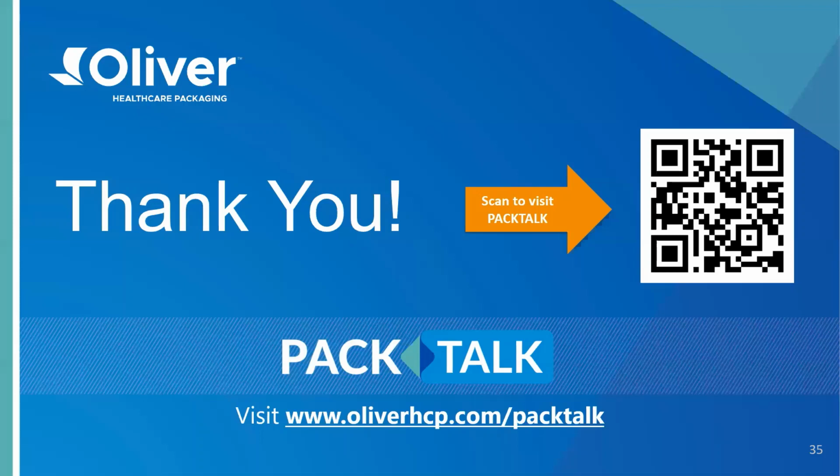And then additional discussions are often about, at a high level, how materials are typically failing in other ways before reaching a high-end peel strength, before it's difficult to open, for example. And this means that the actual high-end spec limits are really related to other failure modes than encountering a package that's too hard to open.